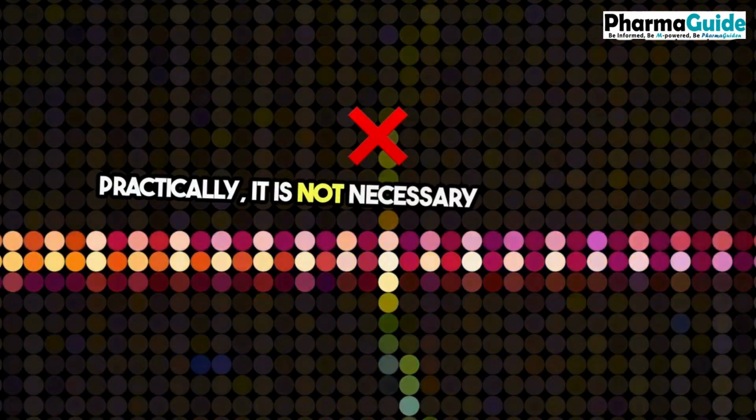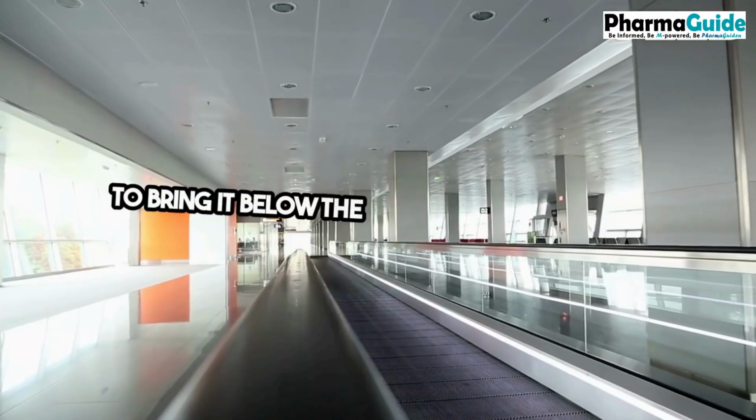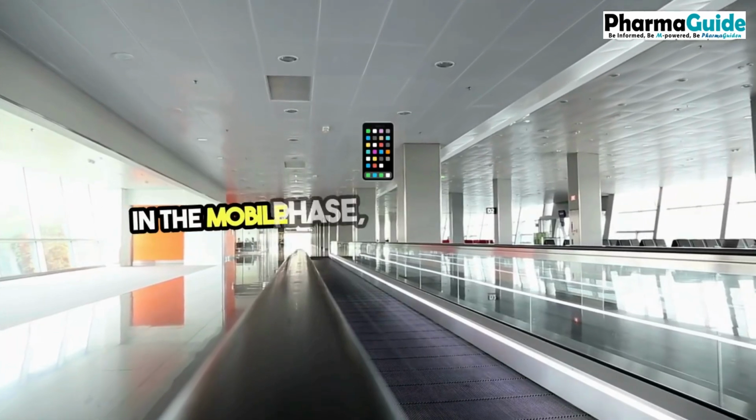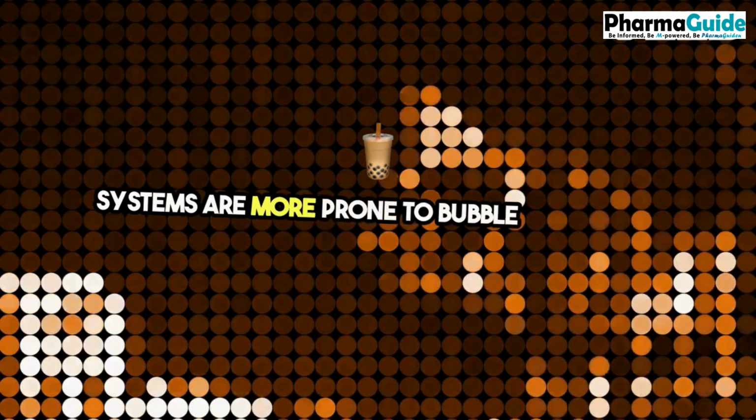Practically, it is not necessary to remove the entire dissolved air, but only a fraction can be removed to bring it below the supersaturation level in the mobile phase. Low-pressure mixing systems are more prone to bubble formation.